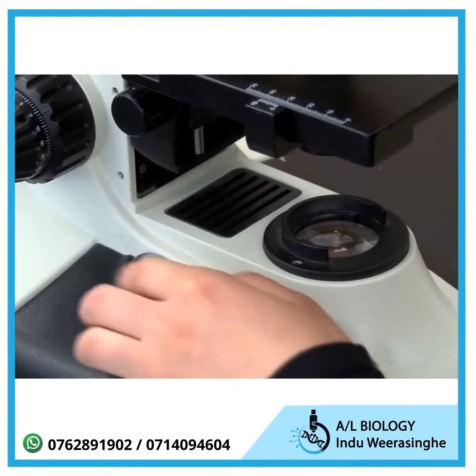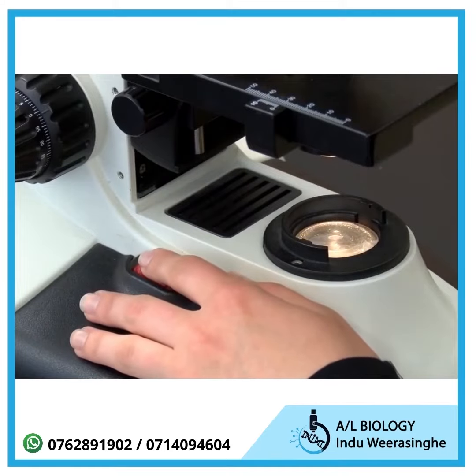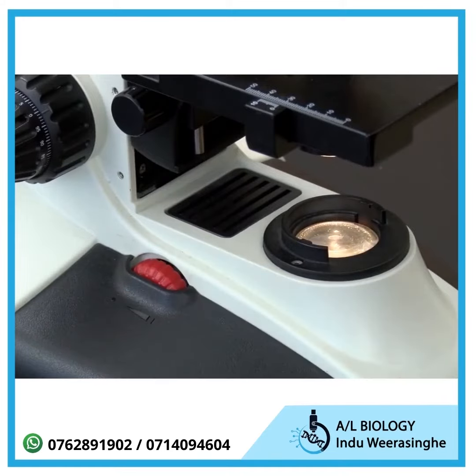Adjust the light to the medium or medium-high range. You can adjust the light later to improve the image. The brightest light doesn't necessarily result in the best image. Now you should be ready to start using the microscope.